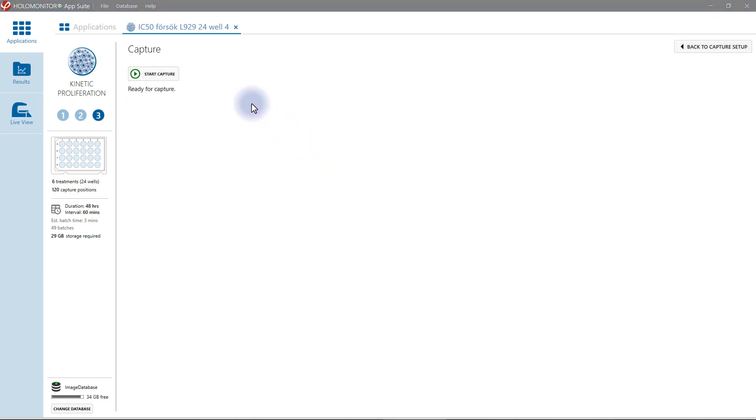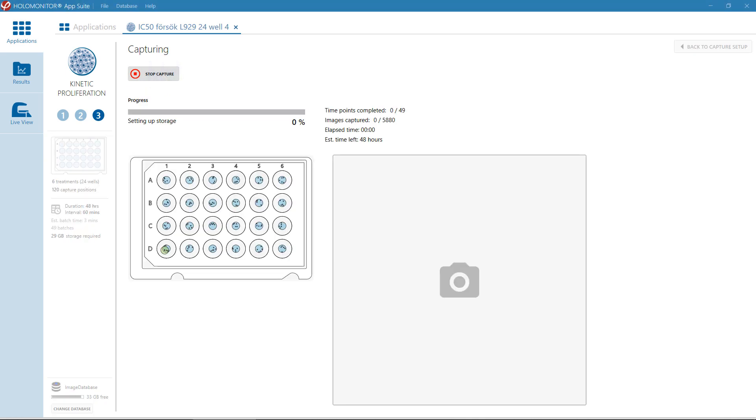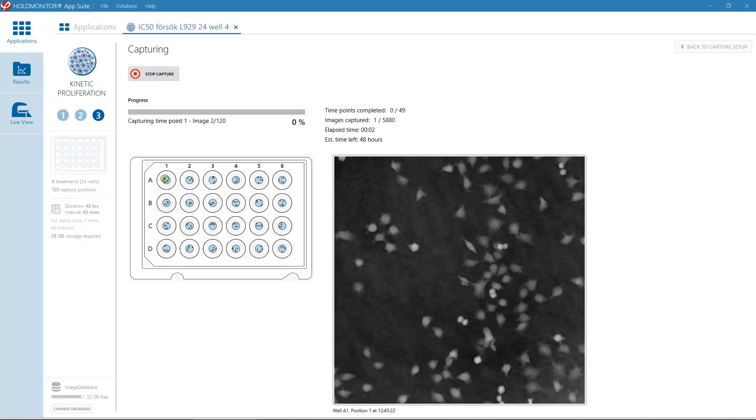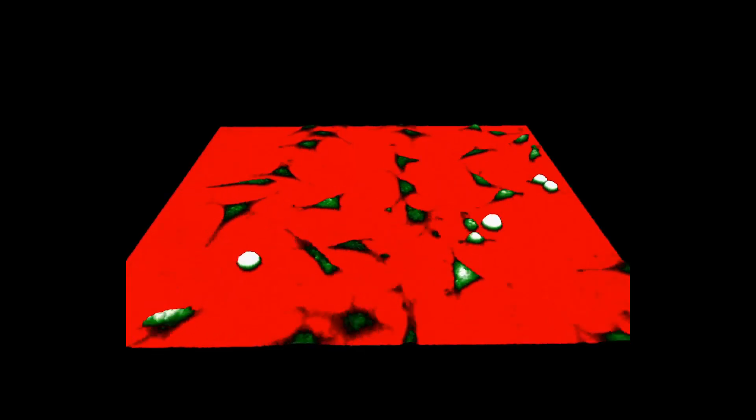Thereafter, all is set to go. Your cells will now grow unperturbed in your incubator or hypoxia chamber. Just walk away without worry and when returning back, the data will be acquired and analyzed, ready to be explored.